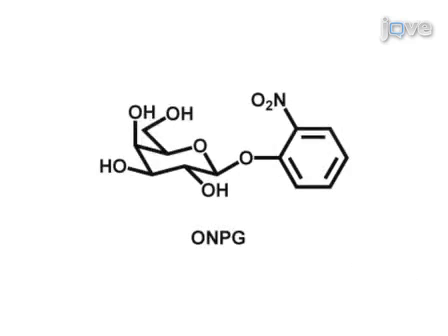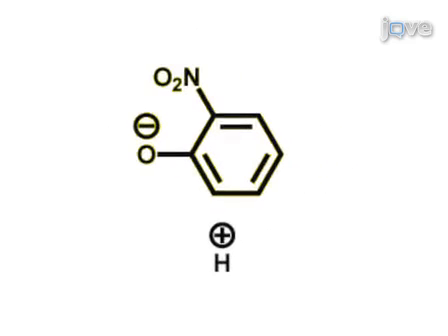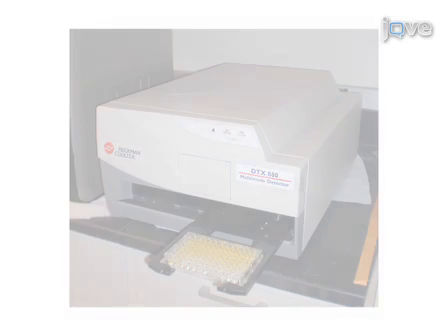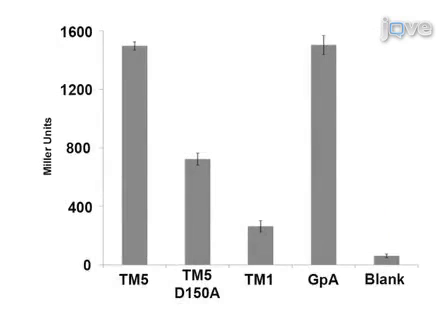As a second step, cells are lysed and treated with ONPG, which is hydrolyzed by beta-galactosidase to the light-absorbing species O-nitrophenolate, or ONP. Next, ONP levels are quantified by measuring absorbance of light at 405 nanometers in order to determine the levels of transmembrane domain oligomerization. Results reveal the oligomerization propensity of the transmembrane domains based on a ToxR reporter assay.